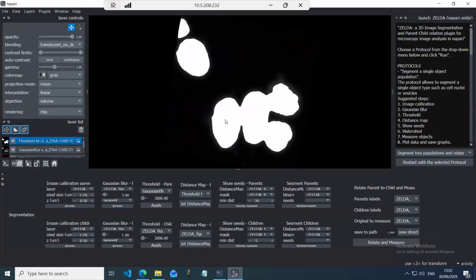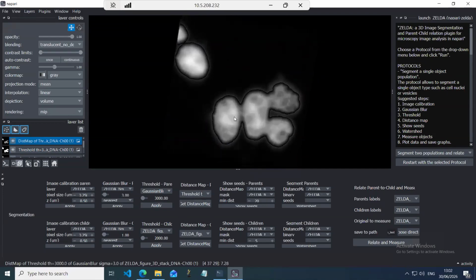So this will create a distance map. Every pixel will be labeled, and the intensity will represent the distance it has from the edge. So the picture represented here is a distance map, visualized in 3D, and can be used in the following block. So here I want to generate a list of points that will be used as seeds for the expansion and the creation of labels.